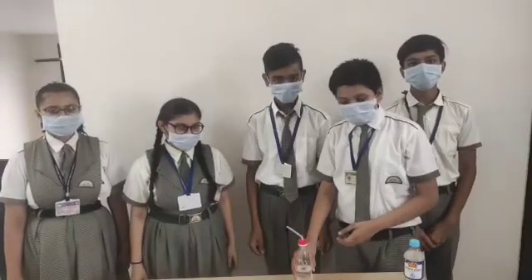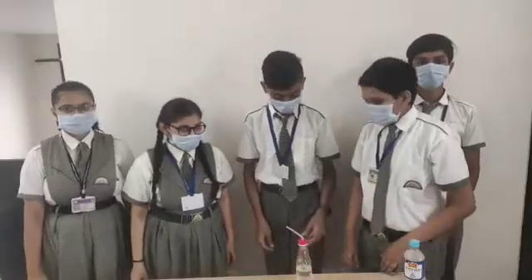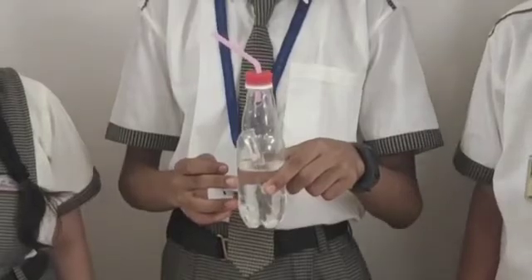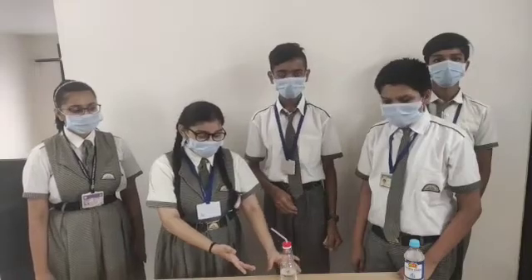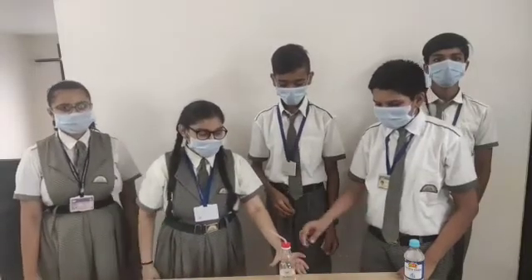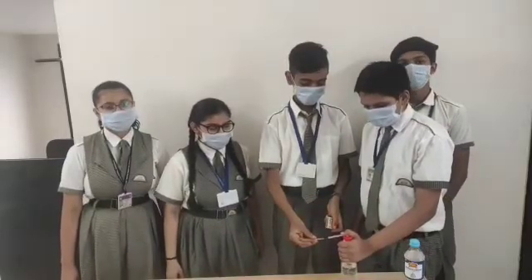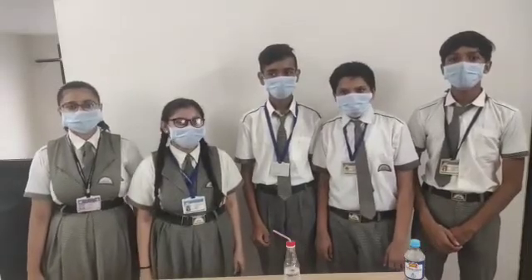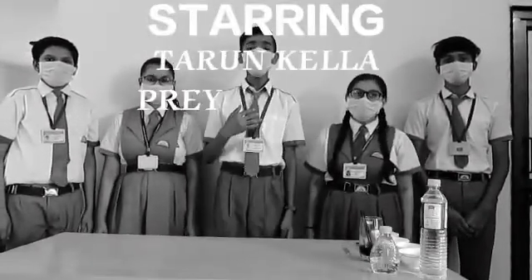Now we are going to do the second activity — the baking soda acid fire extinguisher. Here the actual solution is baking soda and the solution in the test tube is vinegar. They both will react with each other and carbon dioxide will be produced. We consider that the carbon dioxide acts as a blanket to extinguish the flame. Thank you.